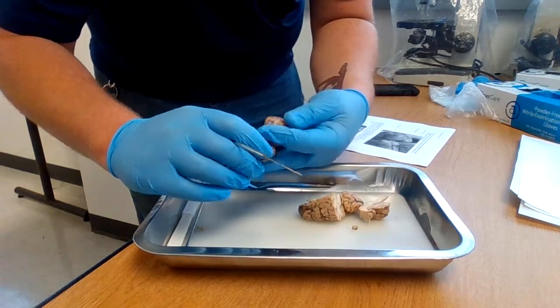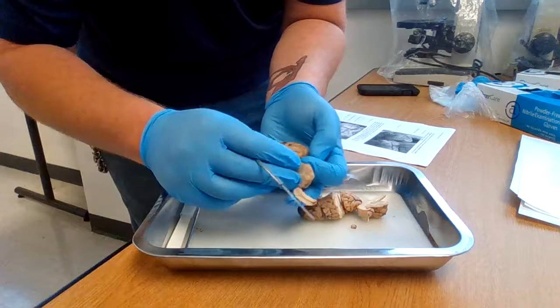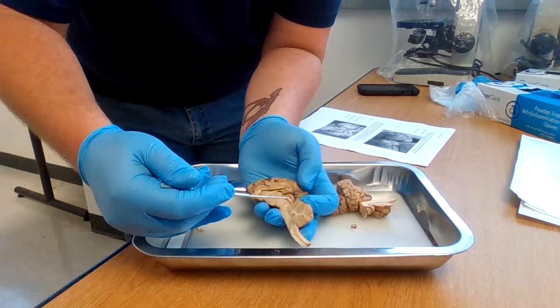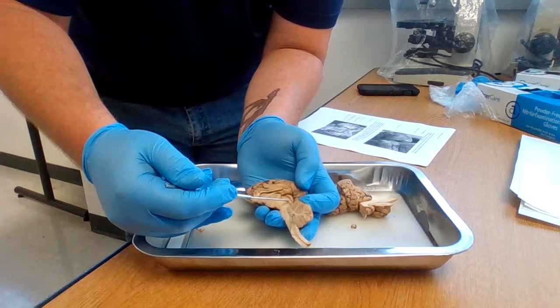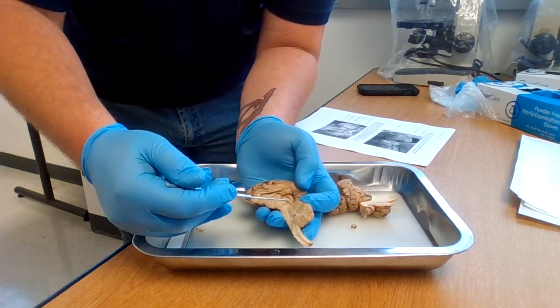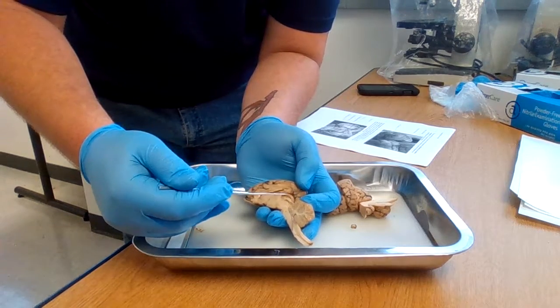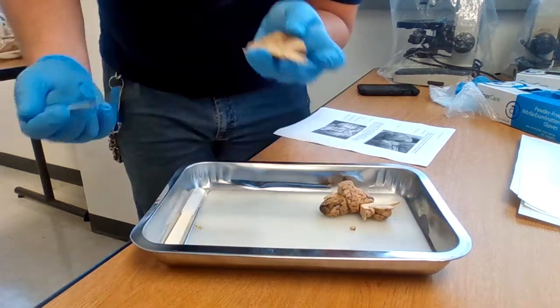If we pull back the cerebellum, we're going to have the inferior colliculus, the superior colliculus, then the number 4 ventricle.